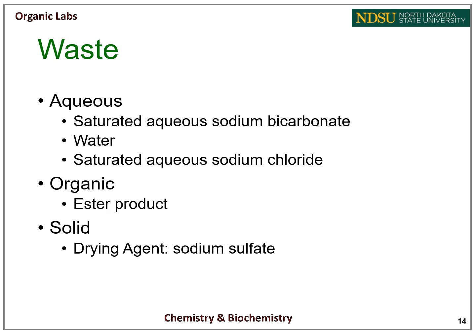In this experiment, you will generate 3 types of waste: aqueous, organic, and solid waste. The aqueous waste will be comprised of saturated aqueous sodium bicarbonate, saturated aqueous sodium chloride, and water. This will go into a liquid aqueous waste jug.